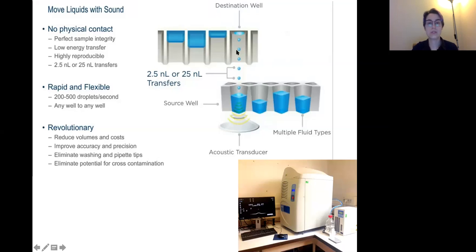And this allows to scale down into just nanoliters of liquid, and at the same time it reduces the use of tips, which is plastic, so it's good, and it allows to handle a larger amount of samples in a smaller space. I put this picture because you can see, for example, this one compared to this huge one, you can have something more compact.